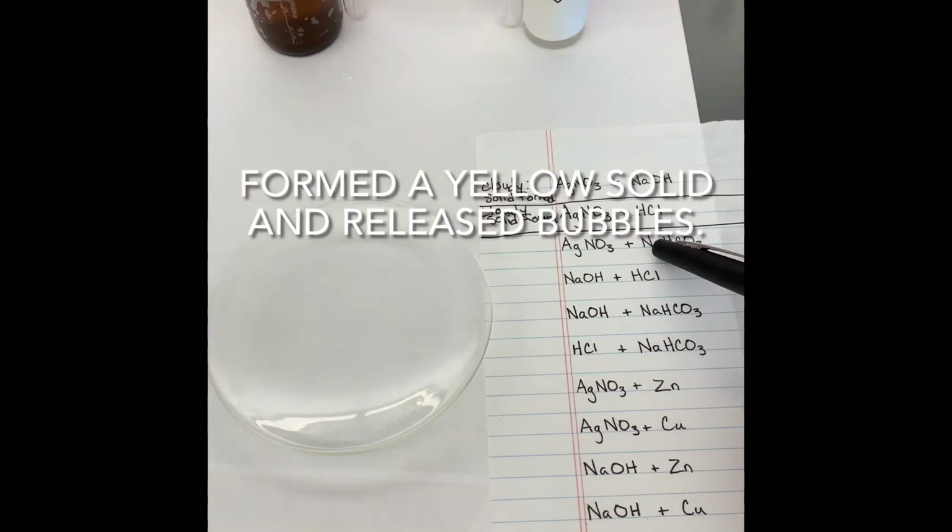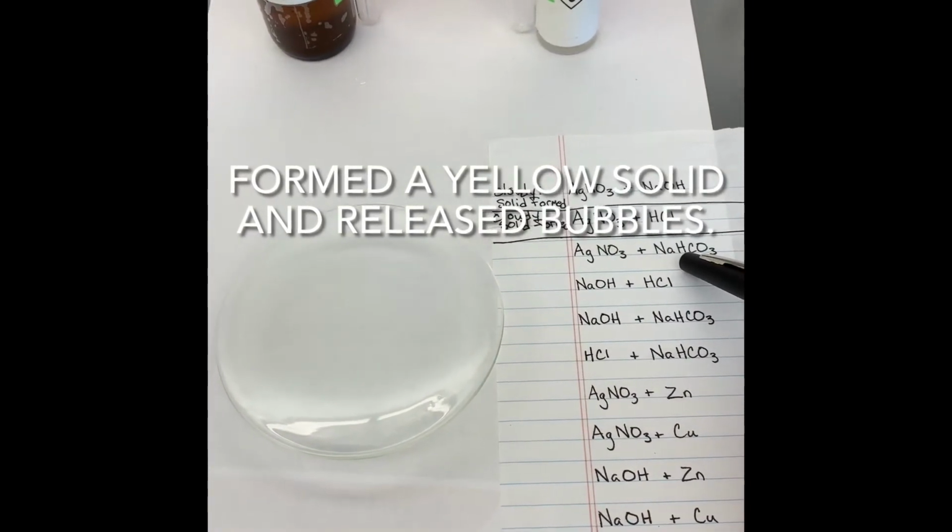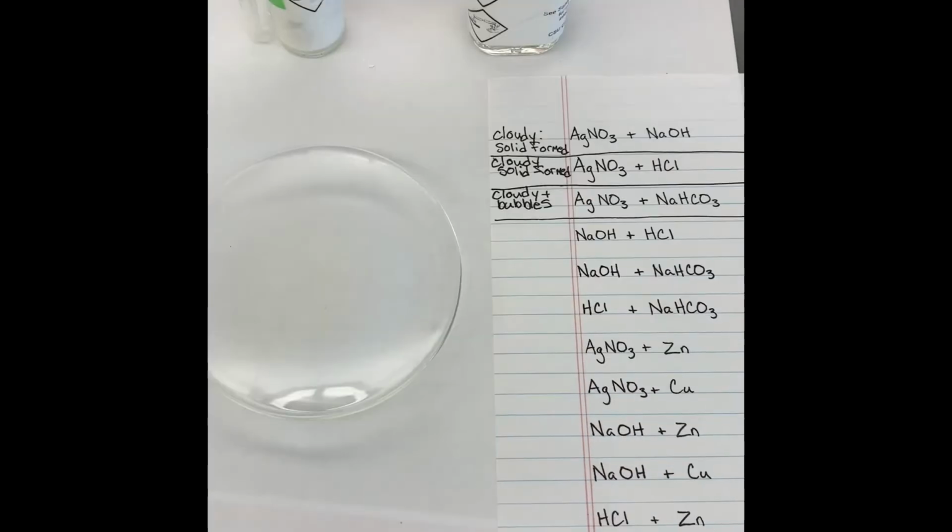Now let's look at silver nitrate and sodium bicarbonate. Now let's do sodium hydroxide, NaOH, and hydrochloric acid, HCl.